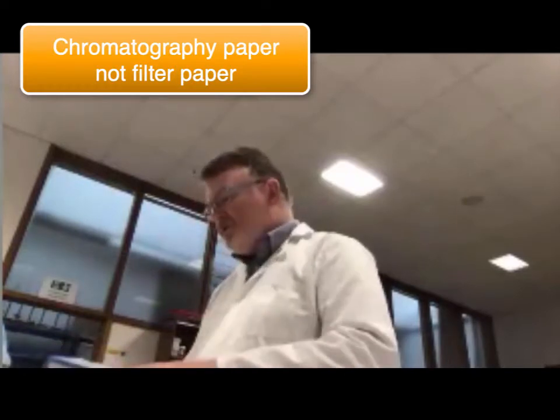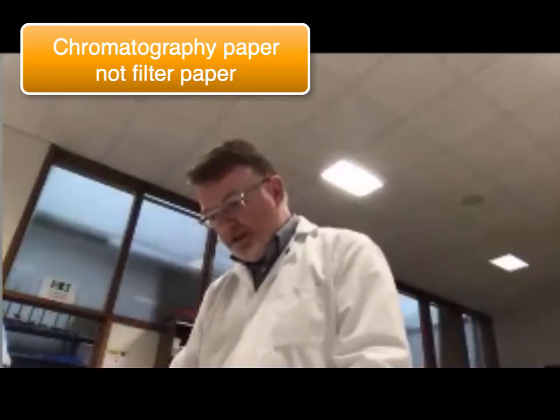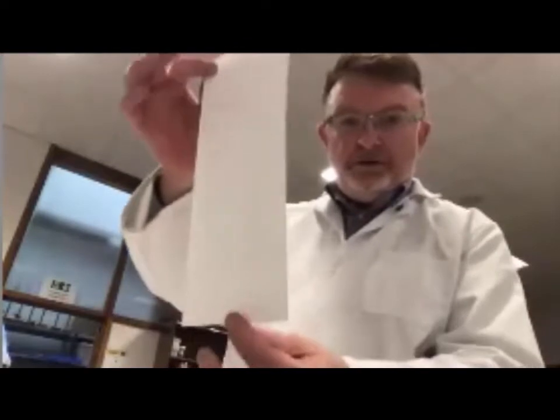when we are in the Leaving Cert, we have pigments that we're interested in, and they're the pigments in plants. What we want to have a look at, for example, is the pigments here. Chromatography, we're going to use paper. So it's chromatography paper as opposed to filter paper. You can use filter paper in the junior cert. So here we have a piece of chromatography paper, and it's long enough to go in our chromatography jar.